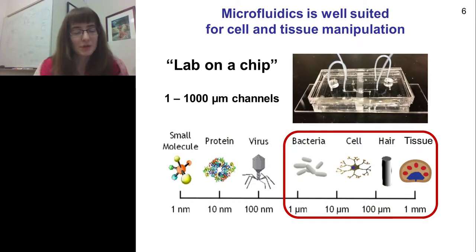So, of course, this is a lab automation talk, and so we're not going to talk just about tissue. We want to put it into a piece of technology that comes from the field of microfluidics. And microfluidics is perfectly suited to study these tissue samples because they're really at the larger end of what a microfluidic chamber can accommodate. So when you're working with tissues, they're often a millimeter in diameter or perhaps a few hundred microns in diameter.